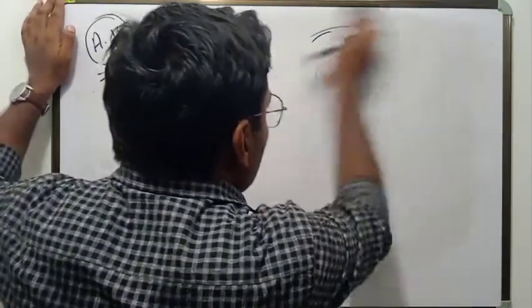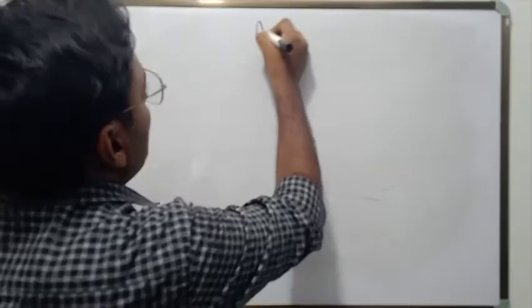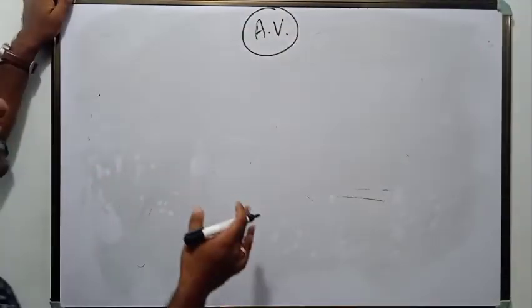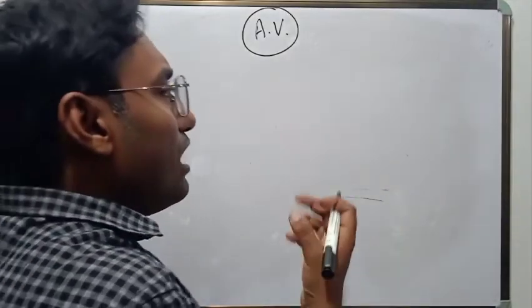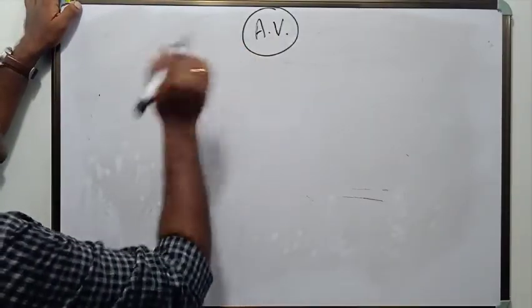Now we will come to see how acid value can be determined. How can acid value be determined? That is what we want to see. How to determine it in lab? The amount of free fatty acids in our oil sample, how much it is, how will we determine? Before that, let me tell you what acid value is.